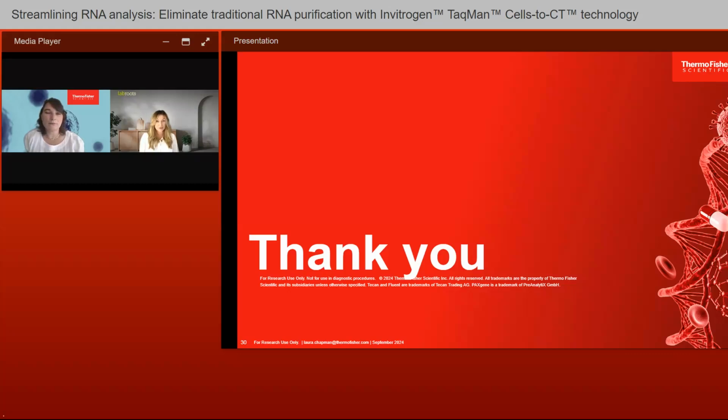Thank you, Laura. Next question is also 2 parts. How does cell density affect the efficiency and accuracy of the assay? And is there a minimum and maximum cell input required for optimal results?